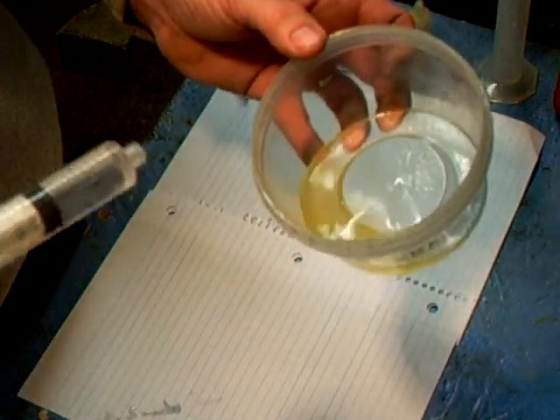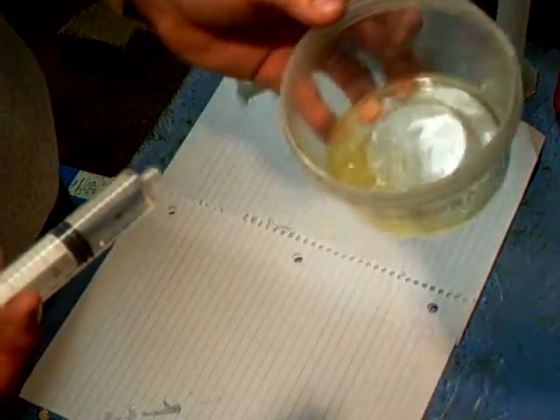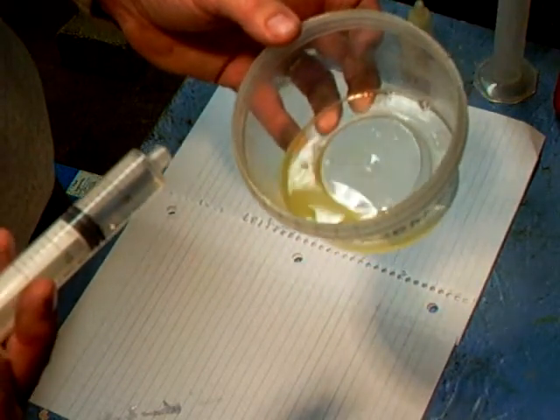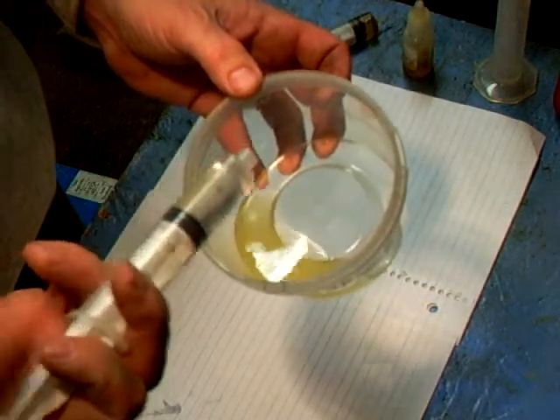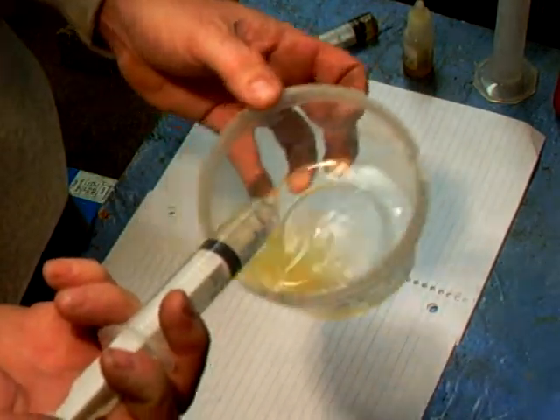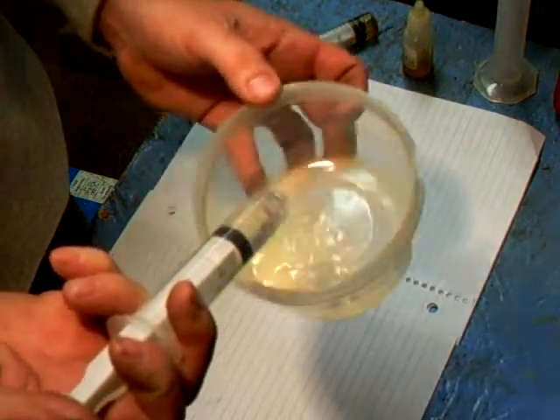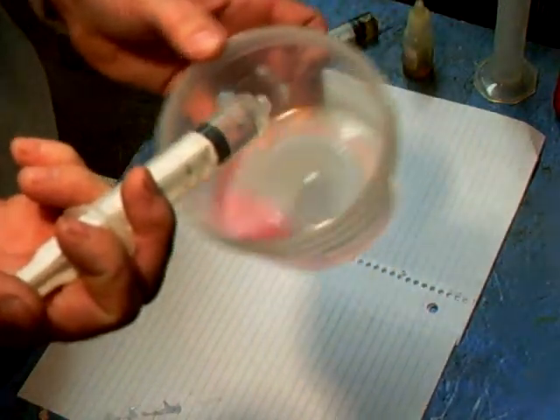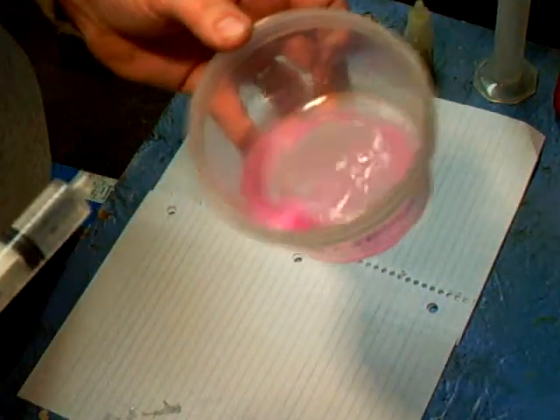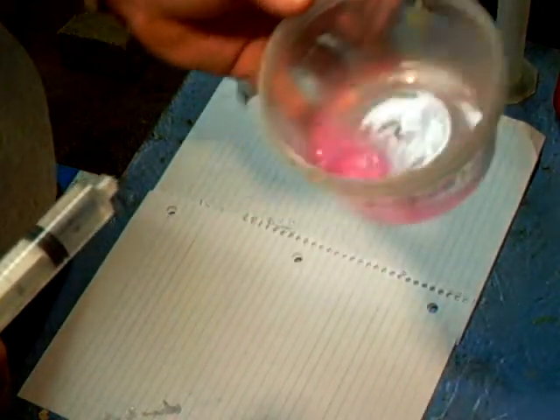Now we start adding reference solution until the yellowish goes out. Some sort of pink or purple may show up, depending on the type of oil. It'll go just a few drops at a time until it changes color. There's a couple drops that turn — I don't know — pink, purple. Let's see if it holds for a minute.